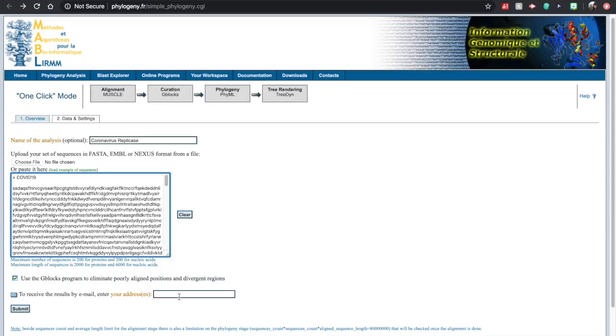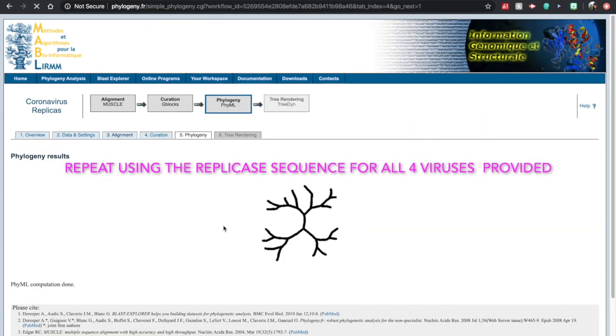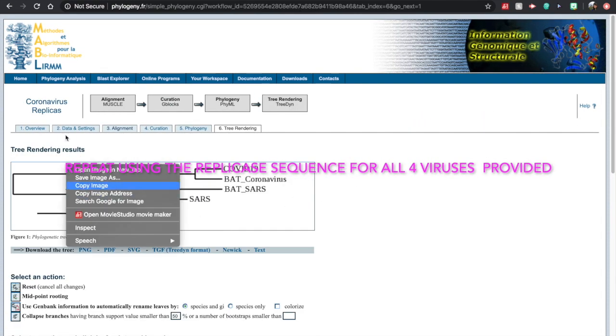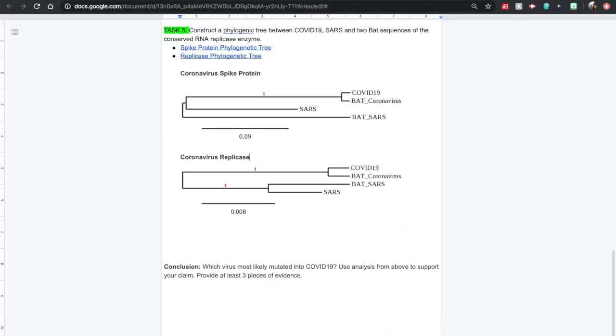Do the same thing here. So this was what I was talking to you about before. You can put your email address if you'd like to have it sent to you. So from each of these data sets, you can see that the COVID-19 is very similar to our bat coronavirus in both examples of the spike protein, as well as the RNA replicase. So from here, you can draw your conclusions based on all of the evidence that we have gathered from the various exercises.